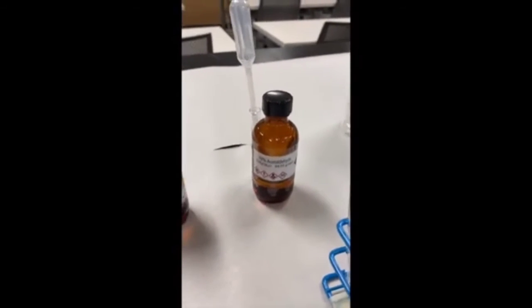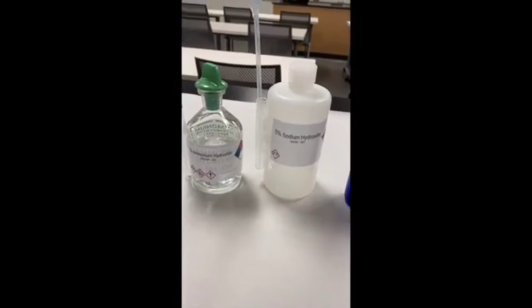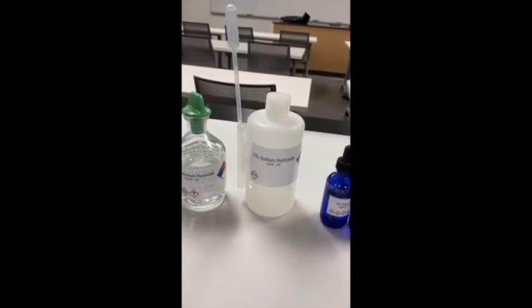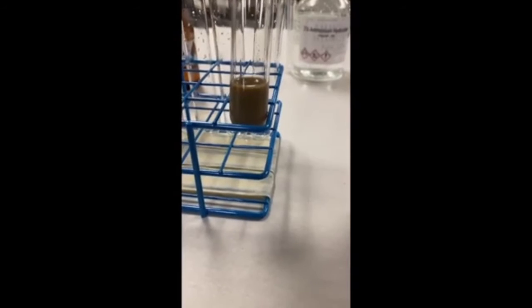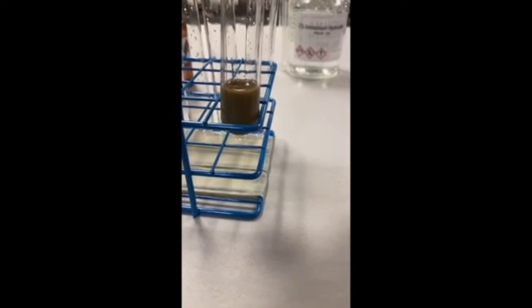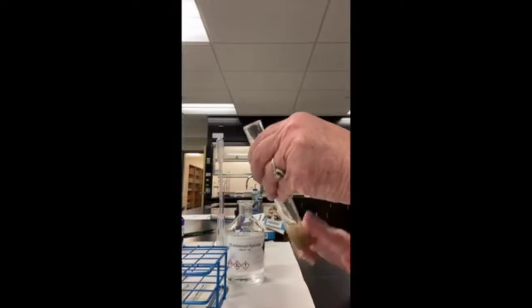Now remember, with Tollens reagent, we're talking about an oxidation reaction. We do know that aldehydes undergo oxidation in this reaction, and ketones do not. To make this easier to see, I actually doubled the recipe, and right now I have in here silver nitrate and my sodium hydroxide. I'm going to go ahead and mix this.